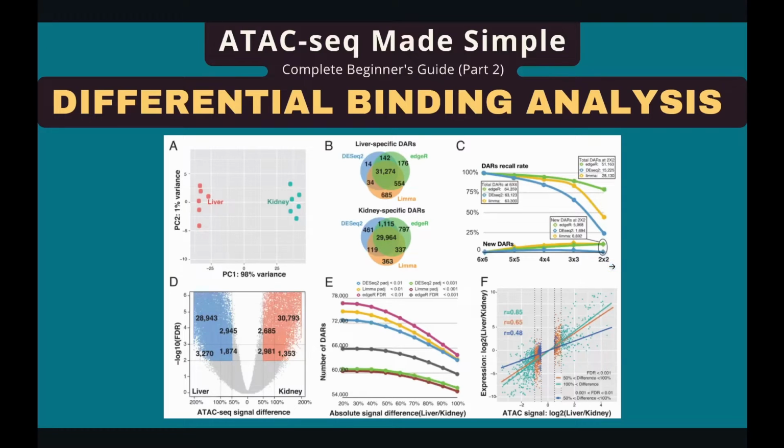In this video, I'm going to show you how to perform differential binding analysis in ATAC-seq data. Previously, I showed you how to perform this analysis in ChIP-seq data. Remember the major problem we face in ChIP-seq data? The peaks identified in each sample are different.